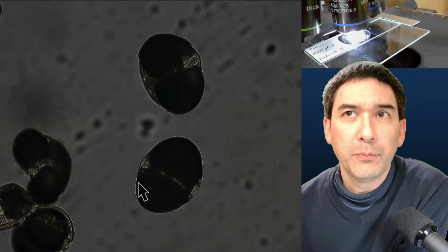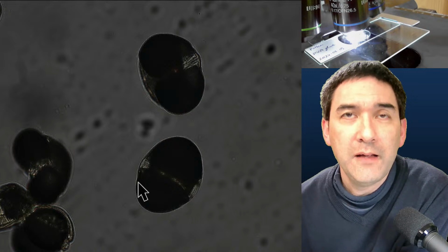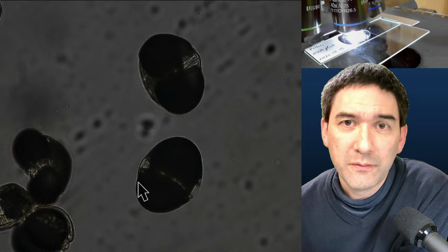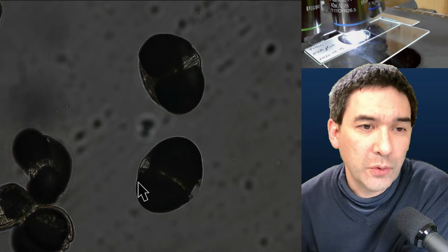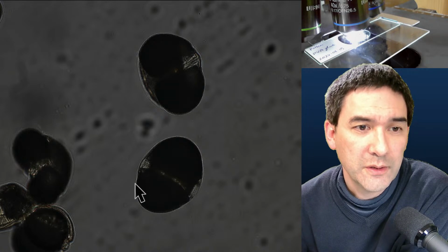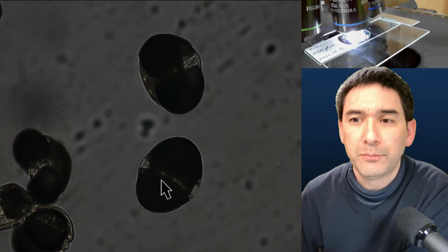So 0.01 millimeter times 5 is around 50 micrometers. So if the width of the arrow is 1, 2, 3, 4, 5 approximately, this is about 50 micrometers across. So it's already pretty large.